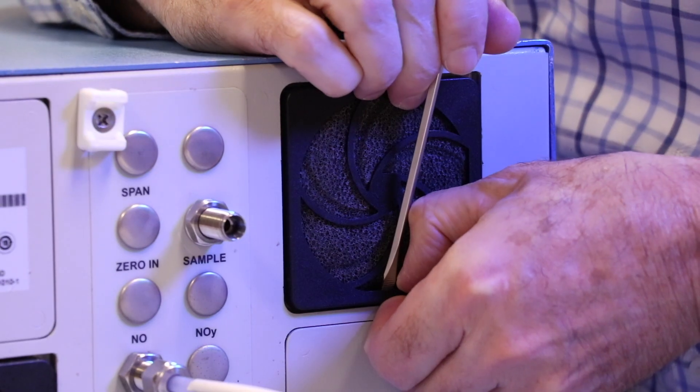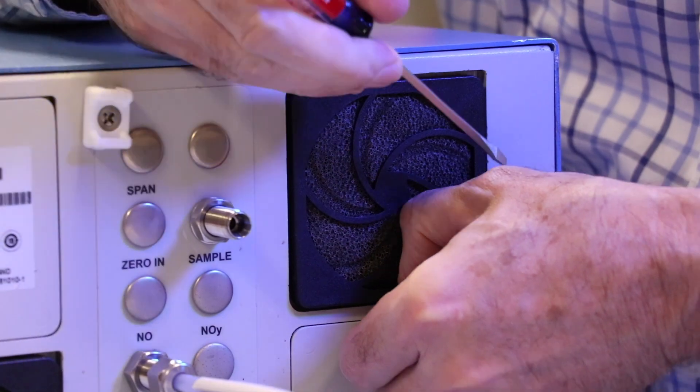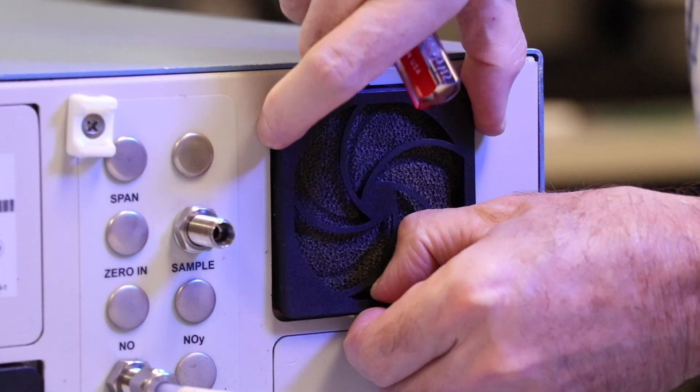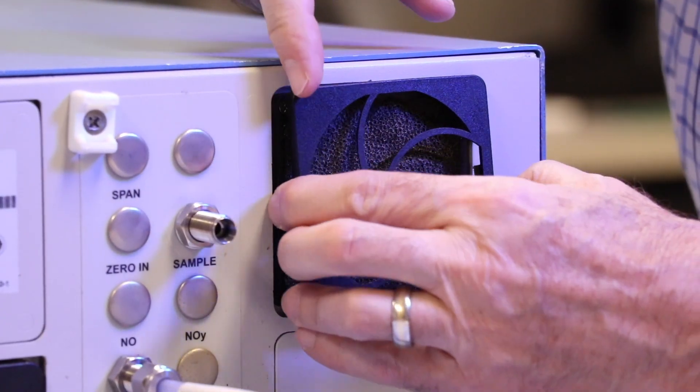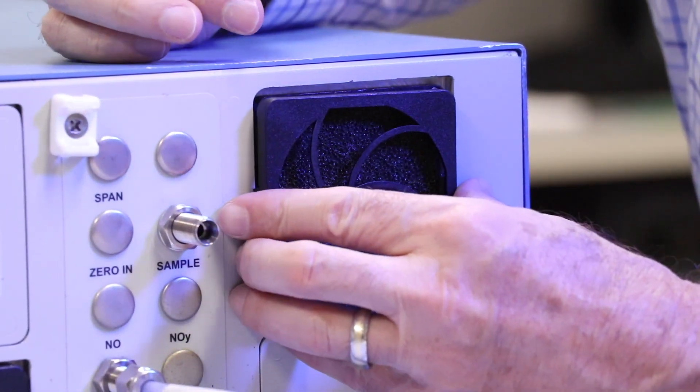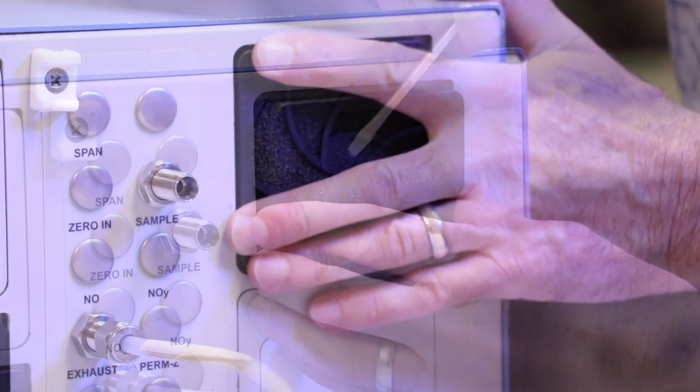Start by removing the fan guard from the fan and remove the filter. Refer to filter replacement on page 7-6 in the manual. The manual recommends cleaning the filter with warm water and letting it dry, or blowing the filter with clean compressed air. We recommend replacing the filter yearly.